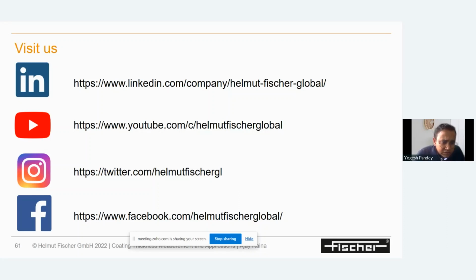Next good question is, for coating identification, are there guidelines to choose specific filters for different coatings? Yeah, it's a very good question from Mr. Vidyanand Galpade. I mean, in detection of the coating or its chemical composition, do any guidelines say which filter we can choose?